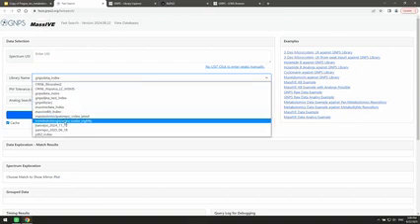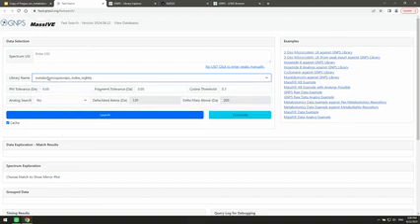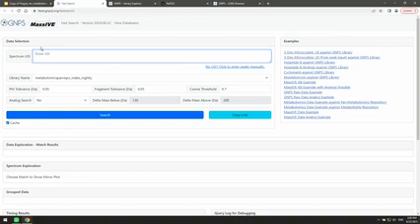Or if you put this one here, then you will do pan-repository analysis, so you will search that lipid against all the repositories, right? And if you then put an amino acid up here, you will search the amino acid against all this data. So it's called library, but it doesn't actually mean a spectral library. It's more of a data science, computer science term in this context. Answers the question? Yeah, so you're not, okay, great.